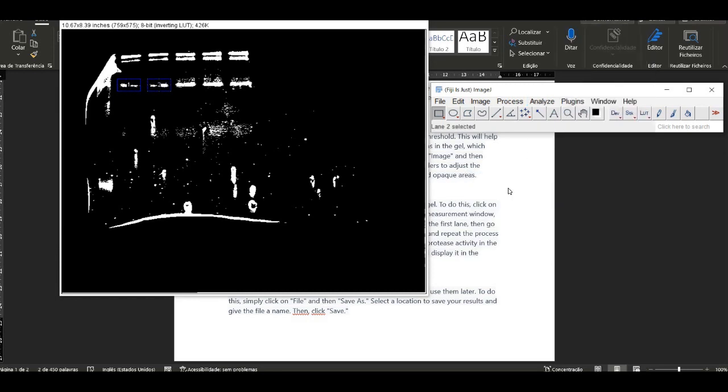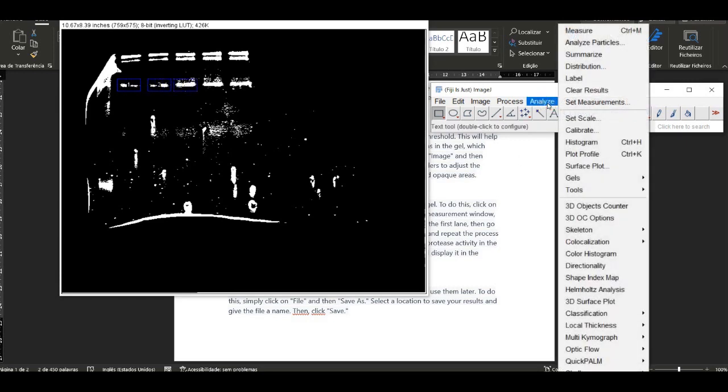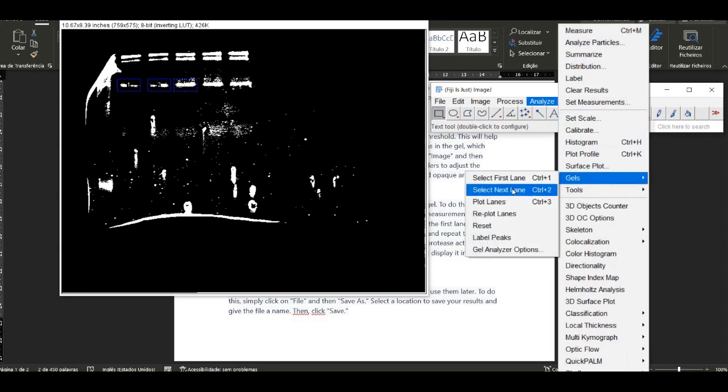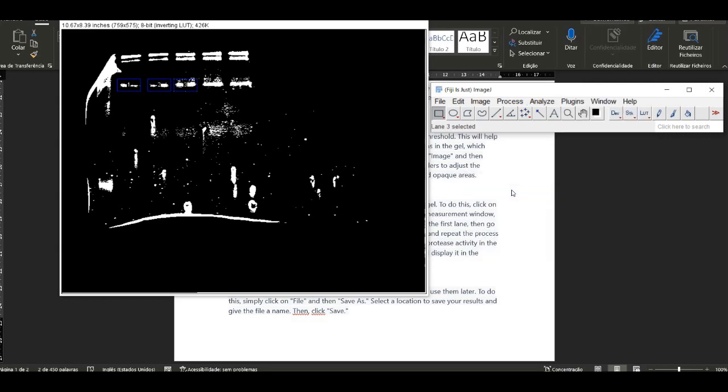The next step is to measure the areas of protease activity in the gel. Click on the Measure button in the ImageJ toolbar. This will open the measurement window, where you can select the gel.